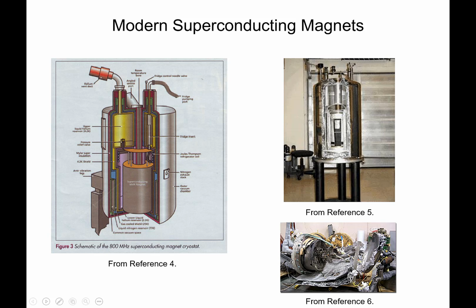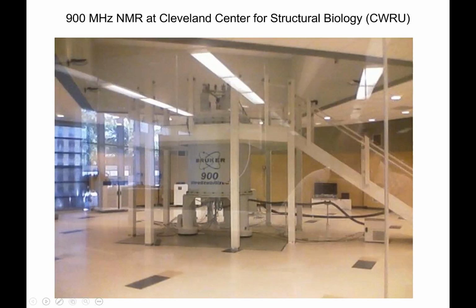I'm filling it every week with liquid nitrogen to keep the liquid helium from boiling off too much. But if the superconducting material ever gets hot, then it starts to lose current, starts to boil the liquid helium, and it shoots out everything, which it did to me. And then it was dead. And that was $10,000 more.